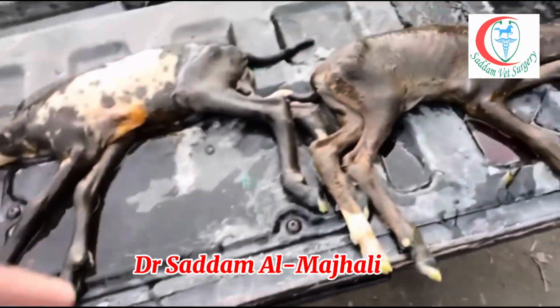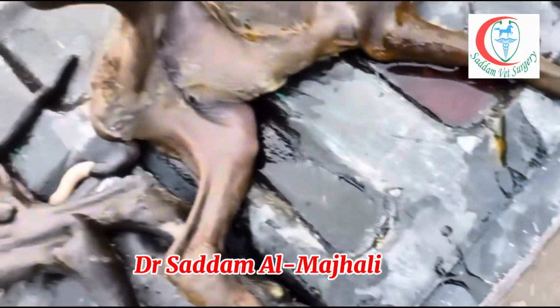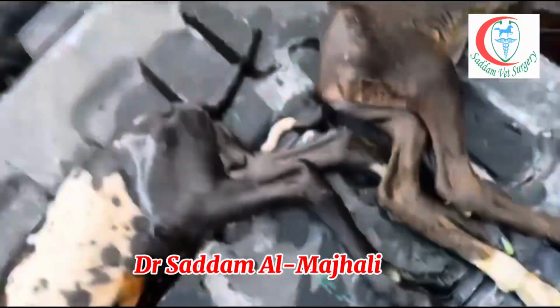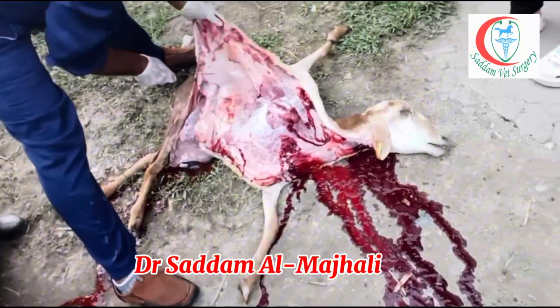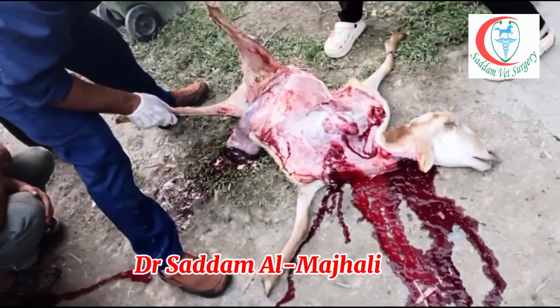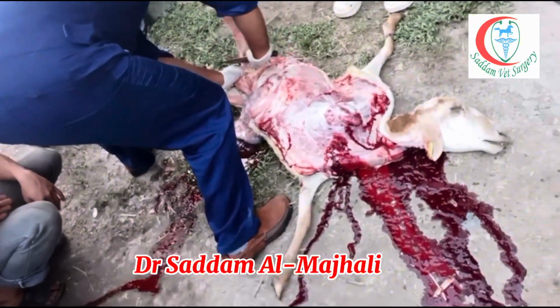All fresh animals should be done postmortem. Okay, so first thing, fresh dead animals should be done postmortem. If more than 3 hours dead, this one can be put down. Okay, I take the other leg, catch. So I continue, open the skin here.